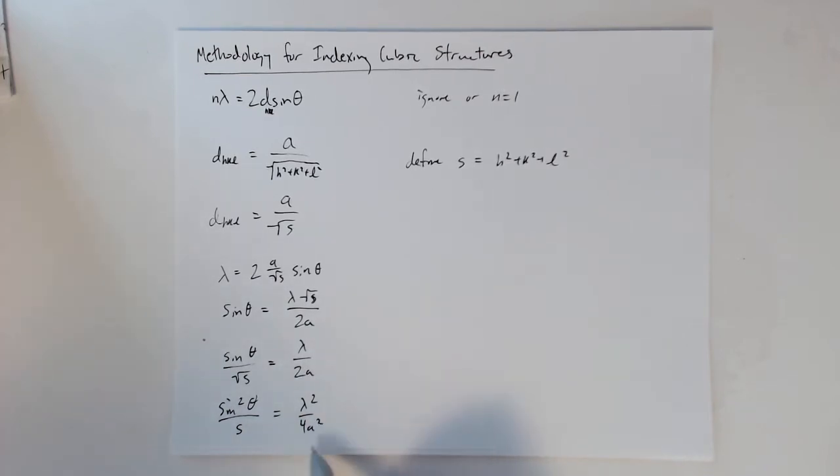And then over here, you'll notice that the wavelength and the lattice parameter are constants for the experiment. If we're looking at a single material that doesn't change crystal structures during the experiment, then this should be the same. We don't change wavelengths during the experiment. So this part changes based on the diffraction peaks, and this part remains constant. That's going to be important for us moving forward.